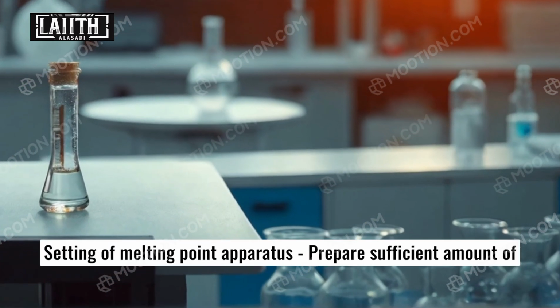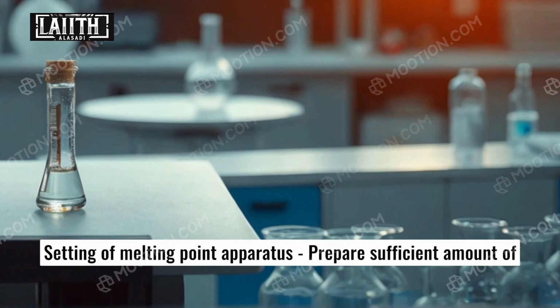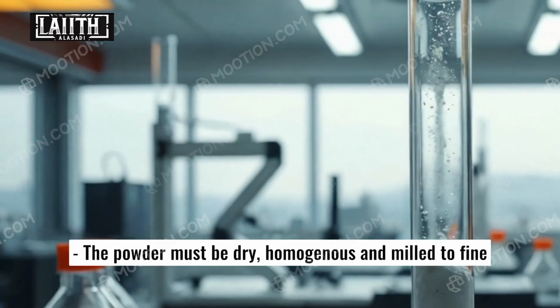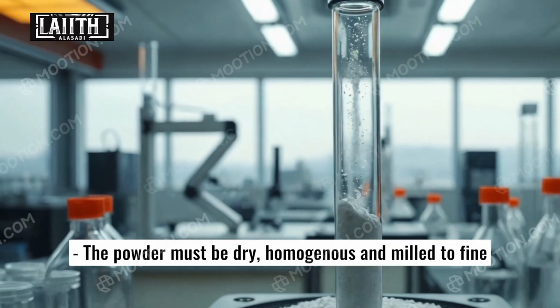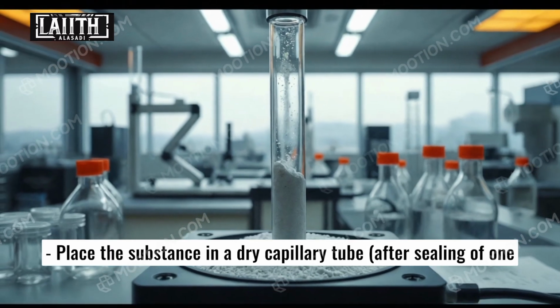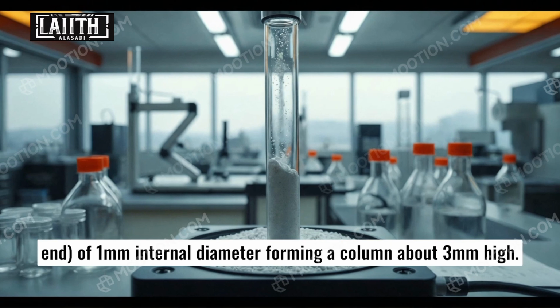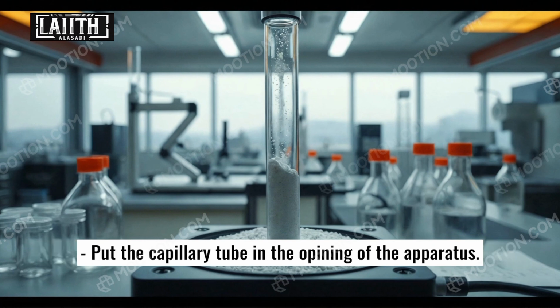Procedure. Setting of melting point apparatus. Prepare a sufficient amount of pure salicylic acid powder and impure powder. The powder must be dry, homogeneous, and milled to fine particles. Place the substance in a dry capillary tube, after sealing one end, of 1 mm internal diameter, forming a column about 3 mm high. Put the capillary tube in the opening of the apparatus.